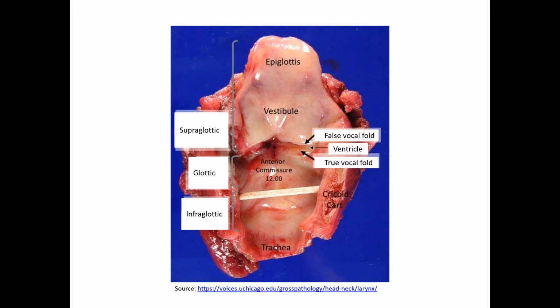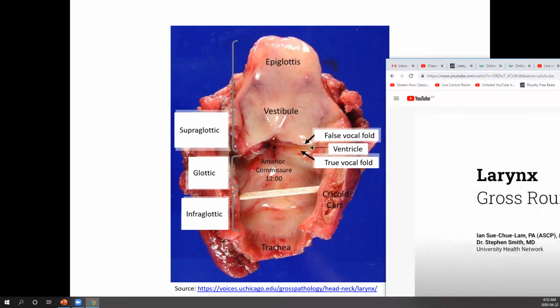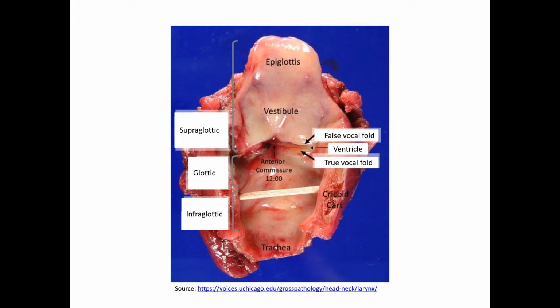And the most common thing that people forget to comment on is the tracheal skin, or the stoma. I need to know what the proximity of the tumor is to that structure, and also does that appear to be involved. And you do have skin there as well, so sometimes I get a little bonus mole. I have found a melanoma once, incidentally, in skin that was taken off as a mole, turned out to be melanoma. And so these are kind of important things that you have to document as we go along.